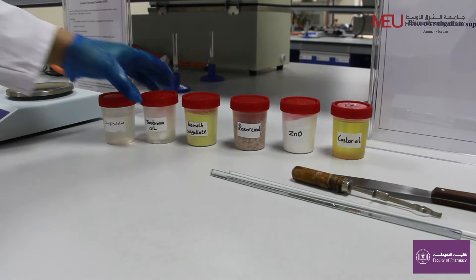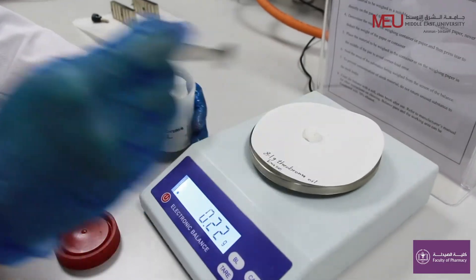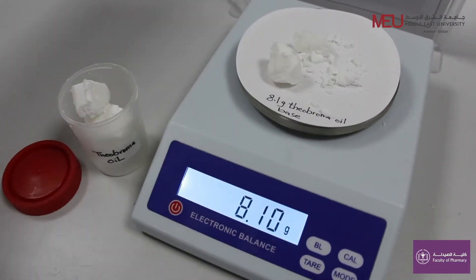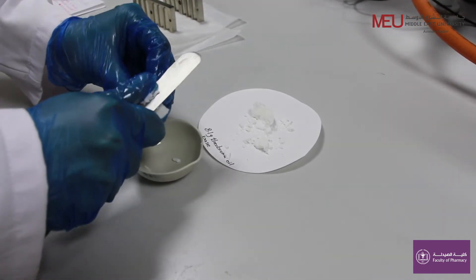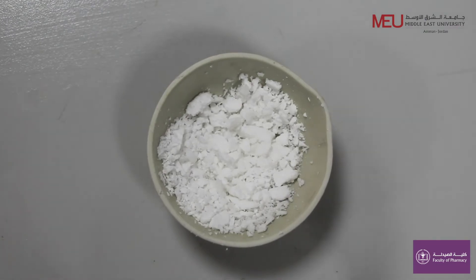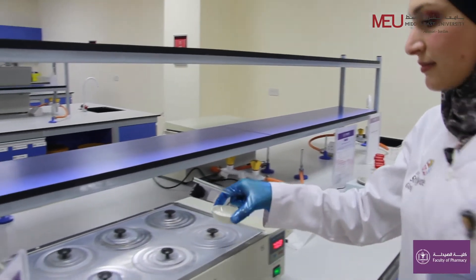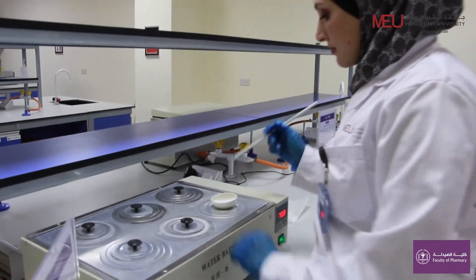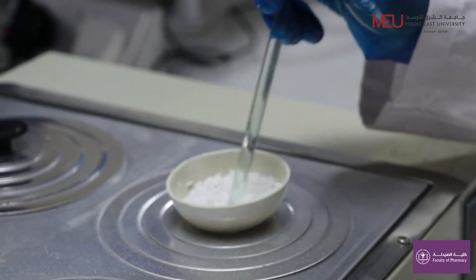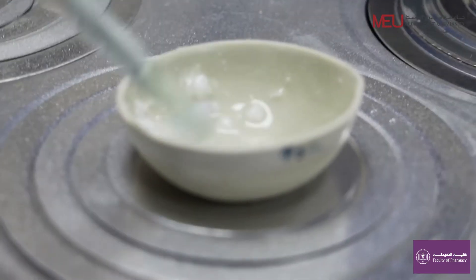Weigh 8.1 grams of theobroma oil which is used as a base. Cut them into small pieces with the spatula and put them in the basin. Warm gently using water bath. Allow two-thirds of the base to melt.